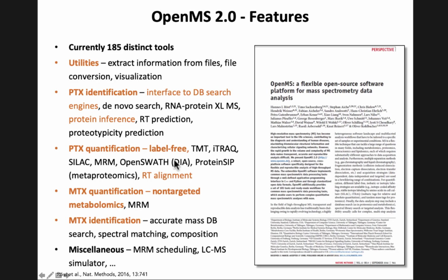Then there are tools for quantification, and we will use the label-free tools, but there are also iTRAQ and TMT and SILAC and, I don't know, MRM, SWATH, you name it. Odds are probably 75% that we have something for that. Then we have tools for metabolomics quantification, non-targeted, targeted, and also for metabolomics identification and various miscellanea.